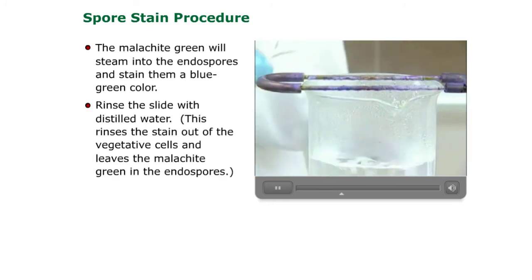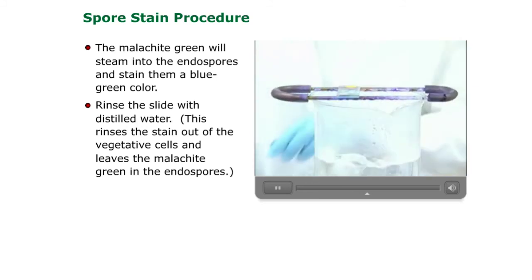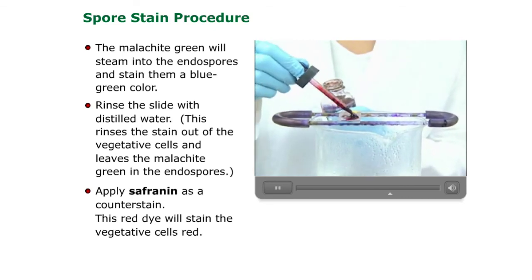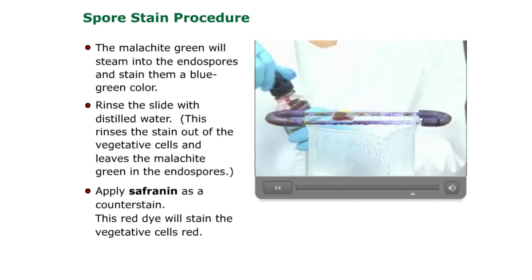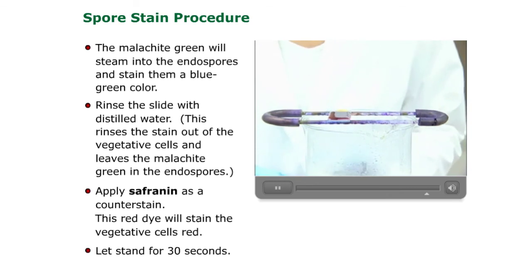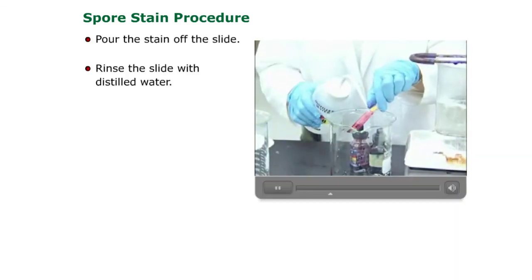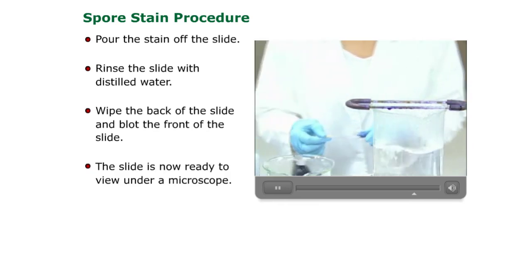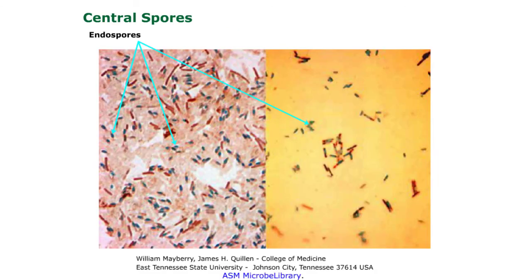After one minute, you will take the slide and rinse it with distilled water. Then continue the stain by using safranin as a counterstain. The safranin will stain the vegetative cells red and the endospores will remain a blue-green color. Leave the safranin on for 30 seconds, then pour it off. Rinse, then dry your slide to use under the microscope. The slide is now ready to view under the microscope.